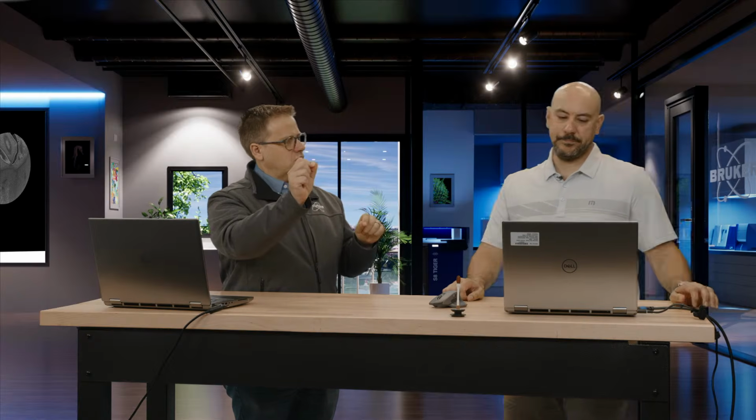The higher the kV, the higher the punching power. And then you mentioned filter. When we say kV, the thing to remember with X-ray tubes is you don't just get that energy. You get everything from 0 to that energy. And that filter helps cut out the lower energy X-rays when you're using a higher kV.